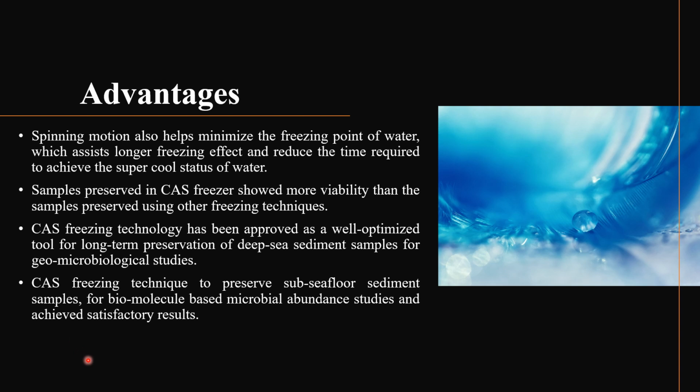CAS freezing technology has been approved as a well-optimized tool for long-term preservation of samples. The CAS freezing technique was used to preserve subseafloor sediment samples for biomolecule-based microbial abundance studies and achieved a satisfactory result. So this technique has an advantage over other freezing techniques because it can decrease the formation of ice crystals which can happen during the other freezing techniques.